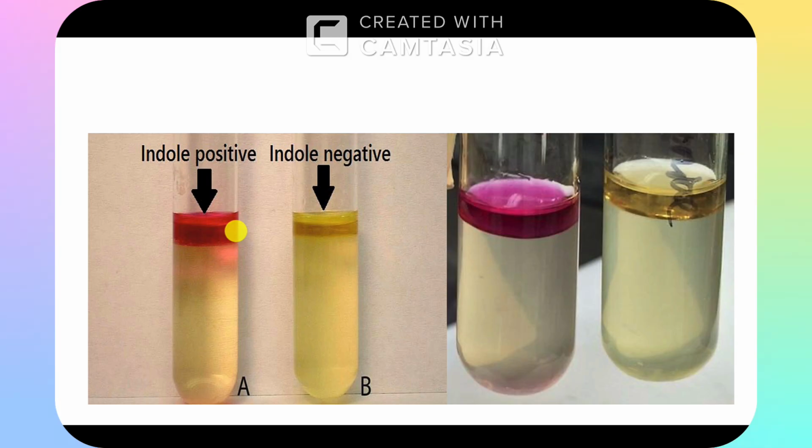So by this test, I can do additional, deeper identification of E. coli, not only on the media. This is an additional reaction, additional identification of Enterobacteriaceae, E. coli and members of Enterobacteriaceae.